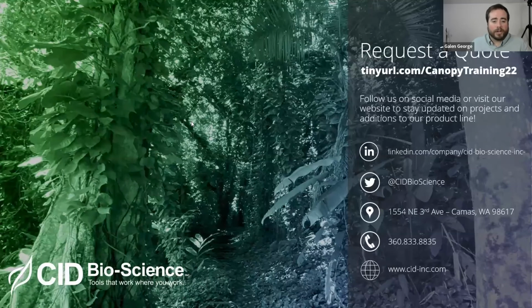And then the next question is the difference between PAR LAI and gap fraction LAI. I already kind of hit on this subject, but they're just two different underlying technologies. The gap fraction is actually using the hemispherical image, and it's making a histogram based on the grayness in the image, and it's establishing a threshold to say what grayness level is sky, what grayness level is plant.